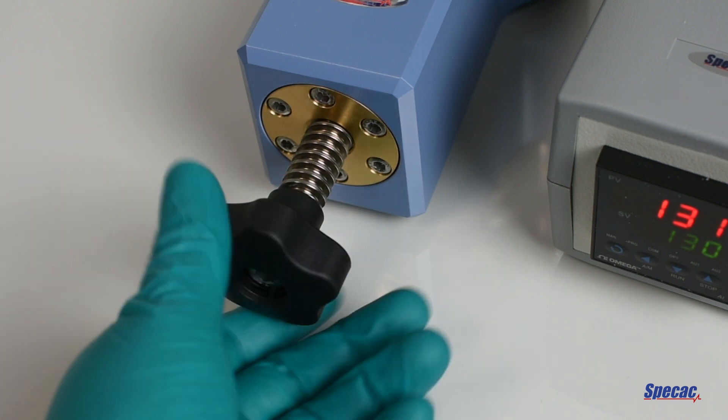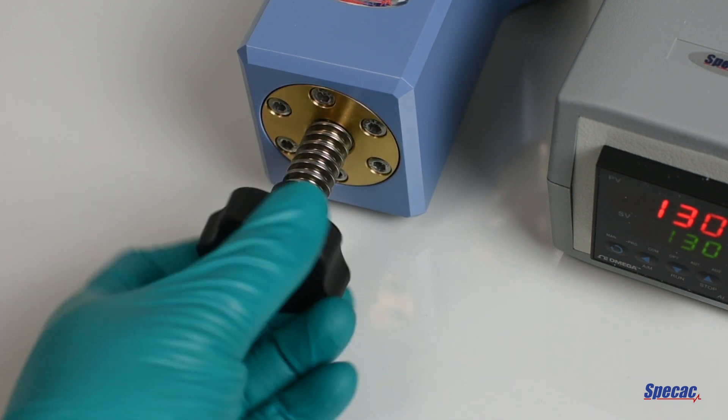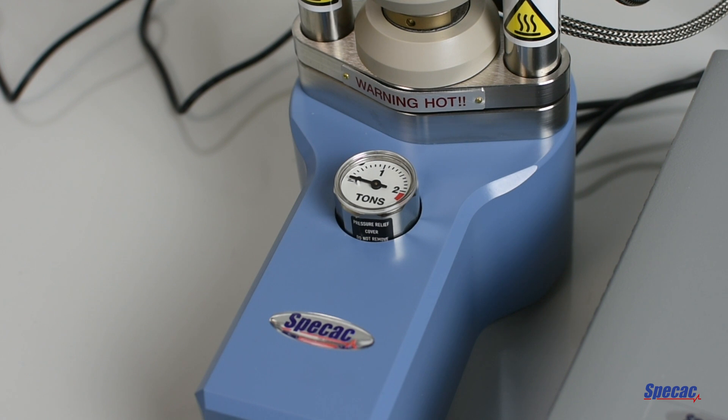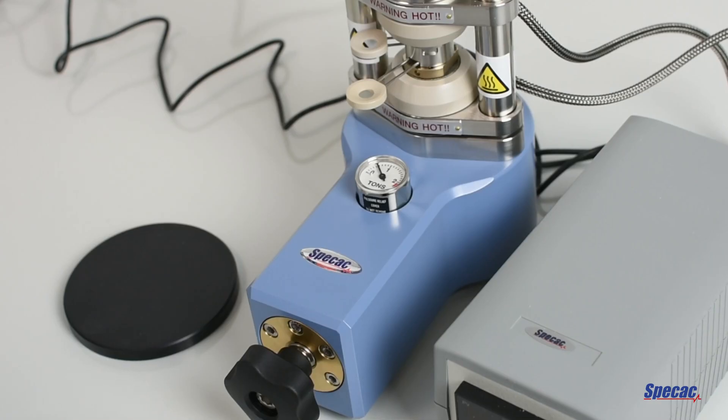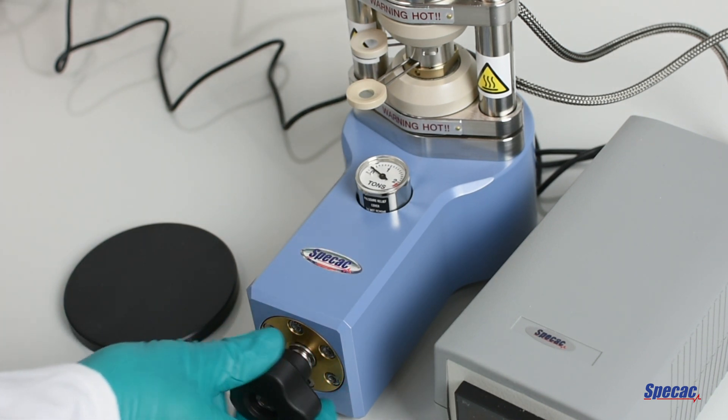Now turn the screw on the front of the press to begin applying hydraulic pressure. An indicated load of 0.5 tons is usually sufficient to form a thin film, as shown here. The applied load is typically held for 30 seconds and then released by unwinding the pressure screw all the way back to its start position.